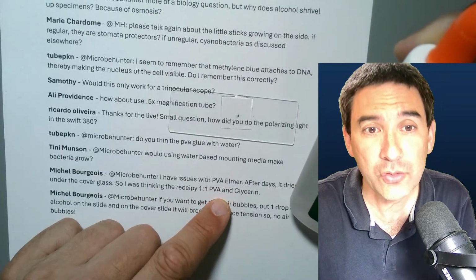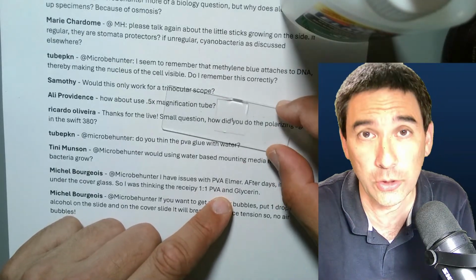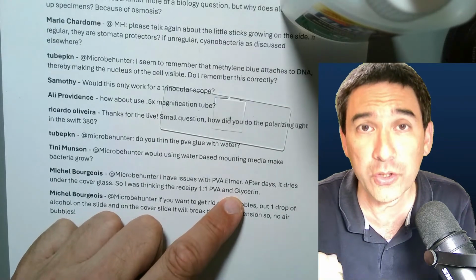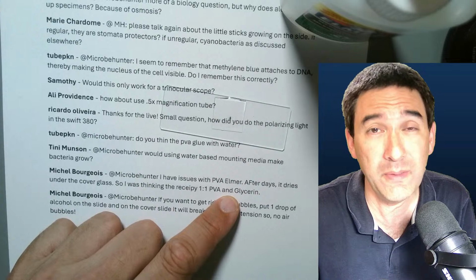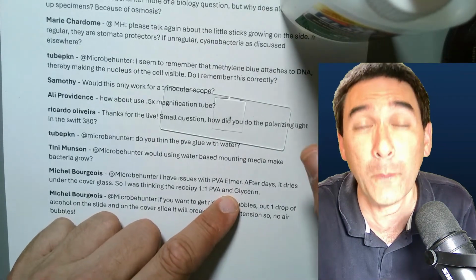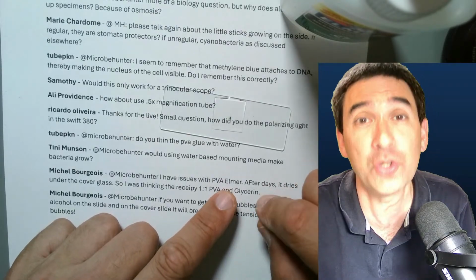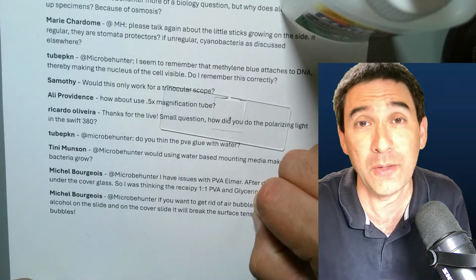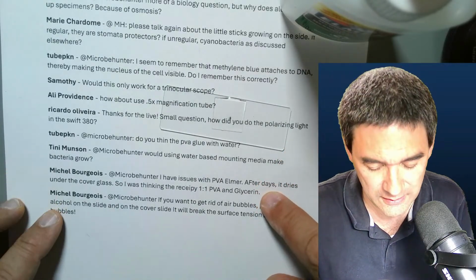Depending on the amount of glycerol that you add, it stays semi-solid. The glycerin will also attract moisture from the air. Therefore I can imagine that for slightly more delicate specimens that do not like to be completely dried, some glycerin can be used, also because glycerin can be used to adjust the refractive index of the mounting medium, if this is important for you.